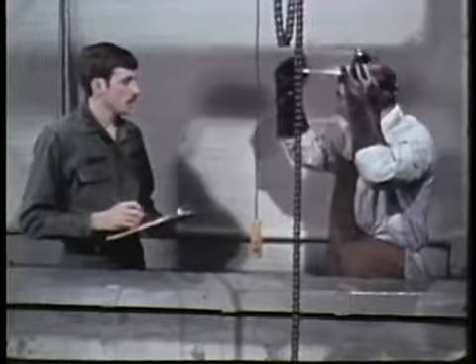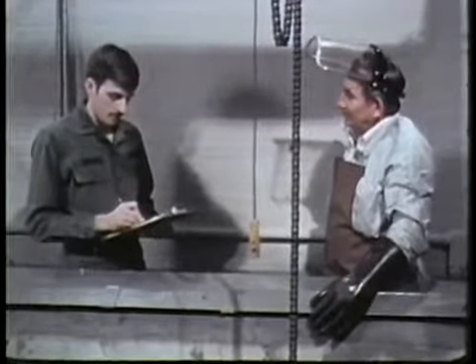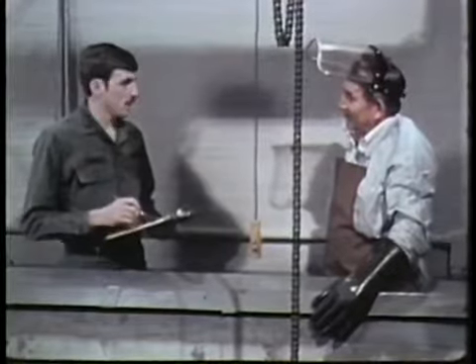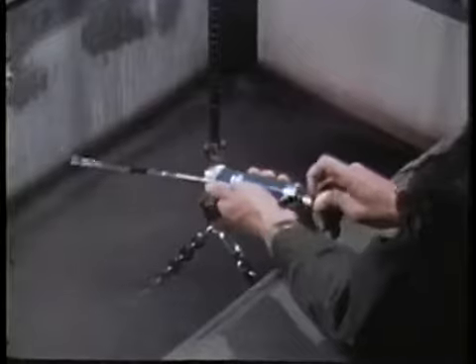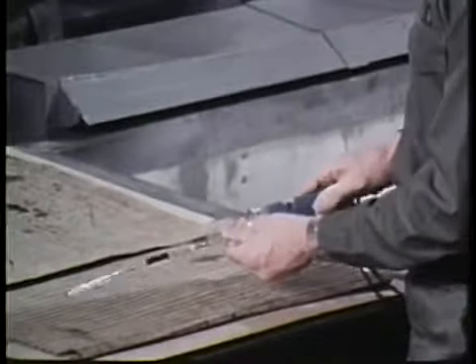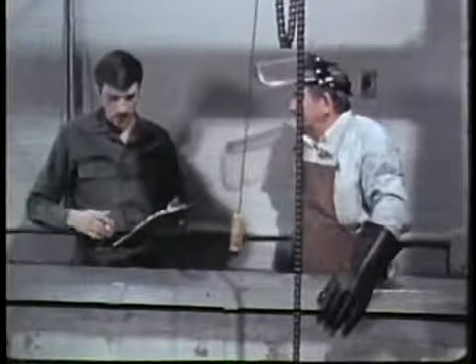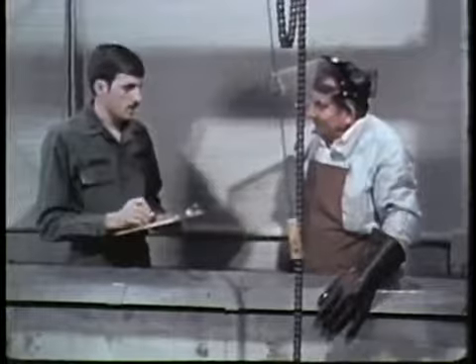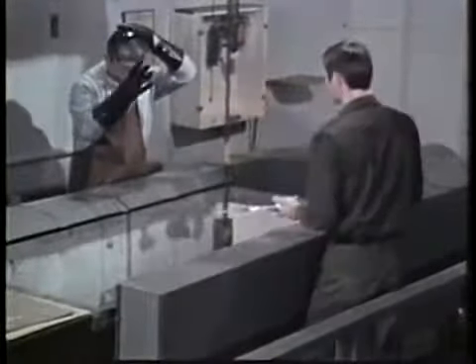While waiting to see if you get a reading, you should check the worker's knowledge of the potential hazards and the necessary safety practices. A positive reading causes a color change or staining inside the tube. Check the detector tube instruction sheet for detailed information. You'll need to take several readings during various stages of the operation. Be sure to change to fresh detector tubes between each reading.